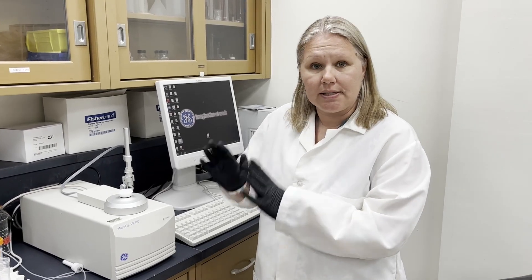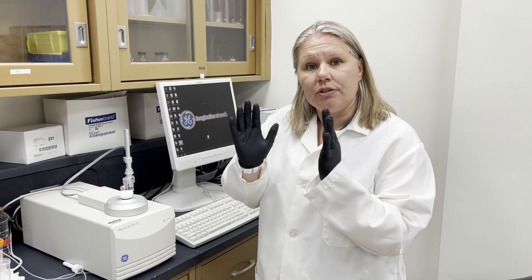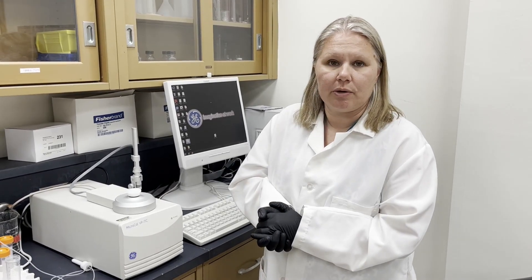The biggest thing with ITC is that the instrument is clean and your samples are dialyzed in the exact same buffer, and I'm of course happy to go through that with you.